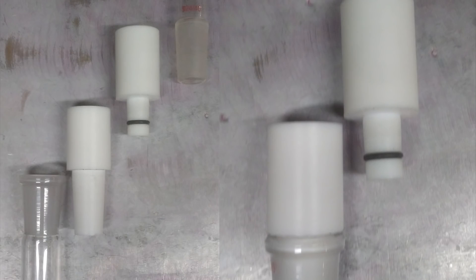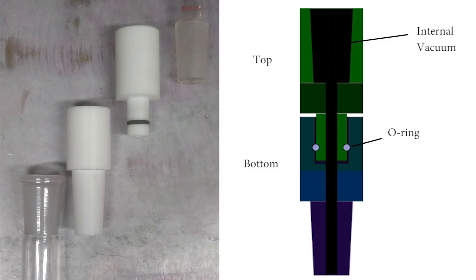The way I solved this was to make two pieces of teflon that lock together using an o-ring. Thanks to a groove that I've cut in both halves, an o-ring can fit in between which makes an airtight seal. But since it's in contact with teflon, it can rotate smoothly. The ends of the coupling each have the proper shape to match the 24/40 ground glass joints that fit in and on here.